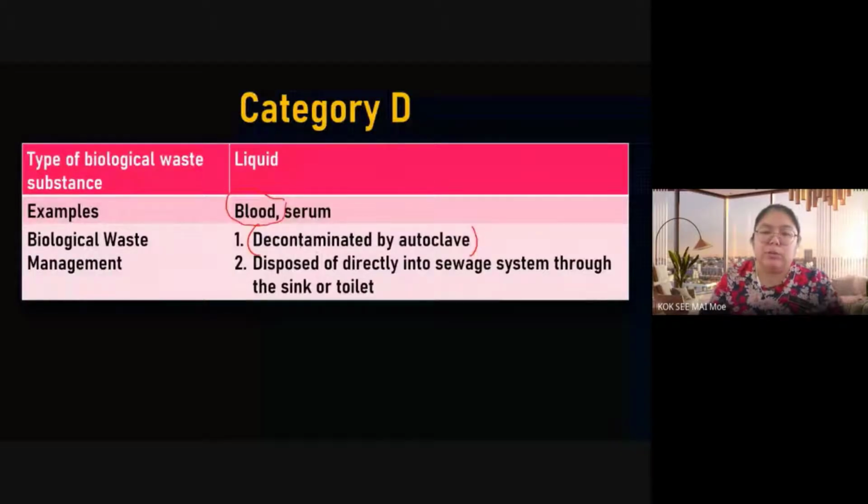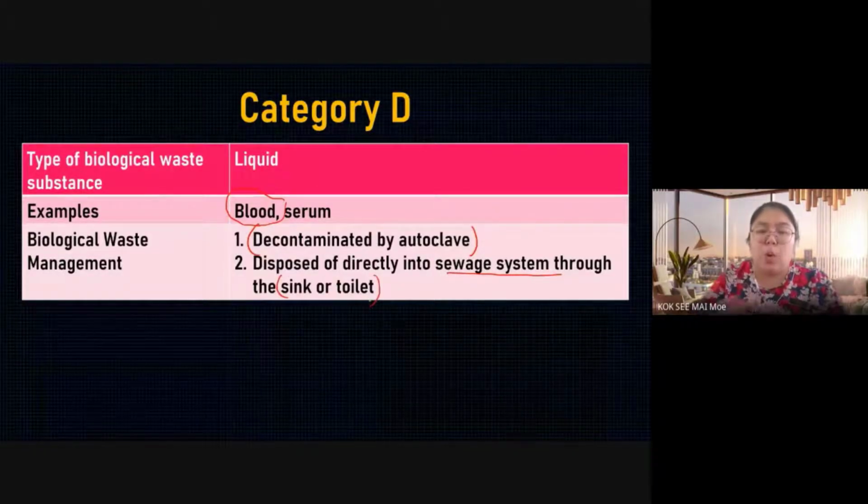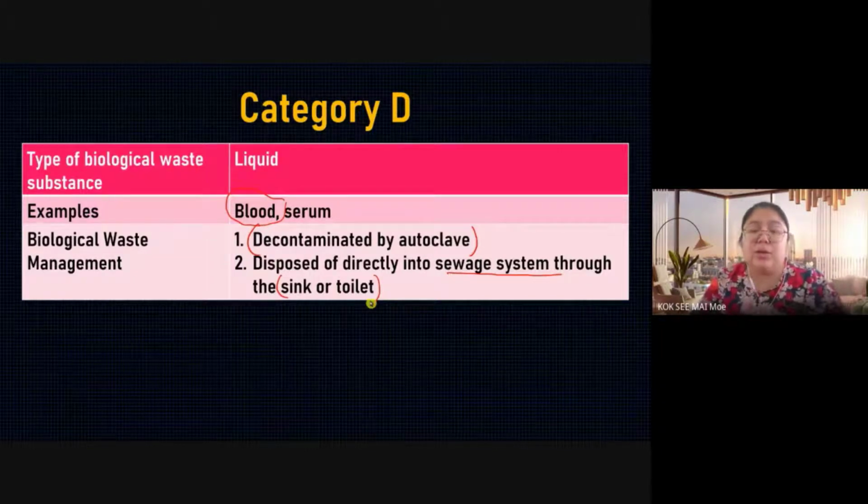Okay, dispose directly into the sewage system through the sink and toilet. That means the straightforward one can be poured inside the toilet and also the sink. Okay, this one can be disposed. So that means they put it inside.